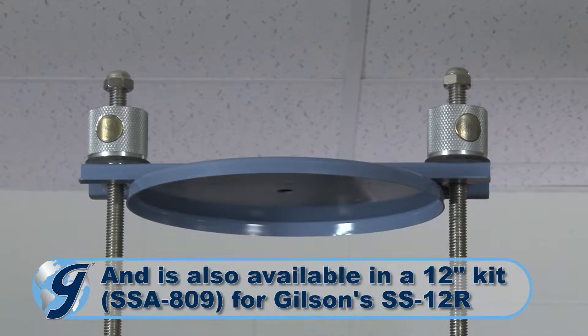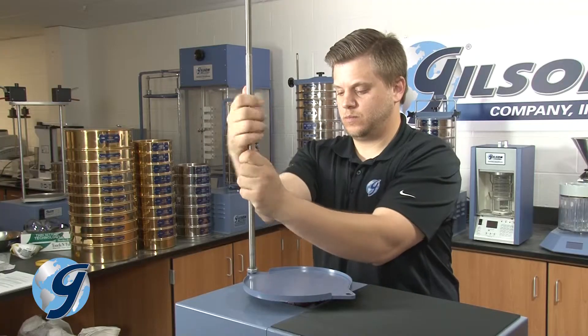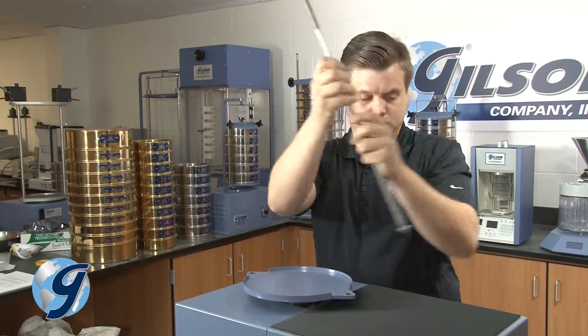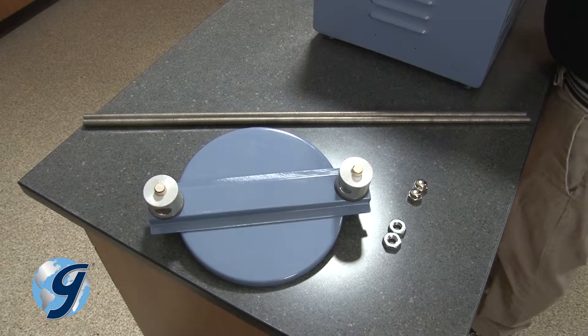First, unplug the sieve shaker. Now remove the existing clamp compression sleeve followed by the two clamp rods and set all items aside. Now you're ready to install the easy clamp system.